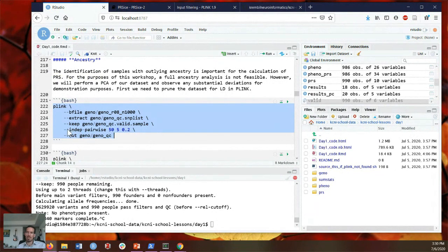The way that this works is it is a sliding window operation where we begin at chromosome 1, go to chromosome 2, chromosome 3, and we start with a window. These parameters can be changed. They can actually have quite dramatic effects on the final amount of data that you include in your analysis. Remember some of those plots I showed in my linkage disequilibrium talk that looked like big red triangles, where you could see the blocks that we would call haplotype blocks, where you may have many SNPs, just a handful, a dozen, maybe several dozen, that are all in very strong linkage.